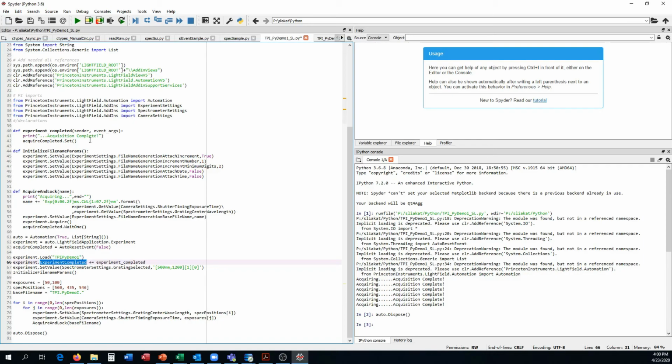Once that happens, you can run this callback function and you can unlock the thread again so that the next iteration in the loop can run. And you can see in this console output, I print the acquiring before I issue the acquire, and then once the callback returns, this line prints out, and then I also unlock the thread.